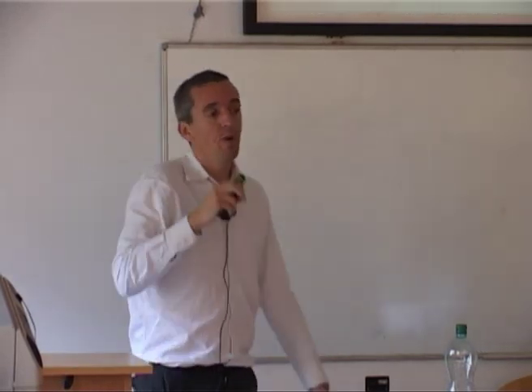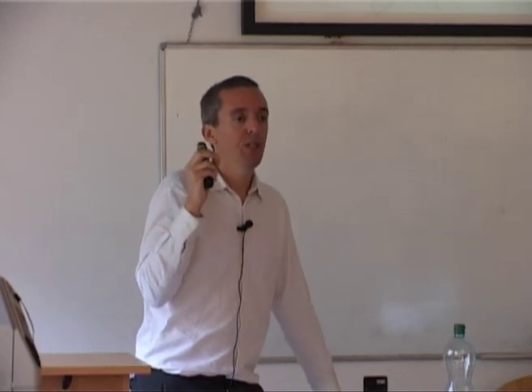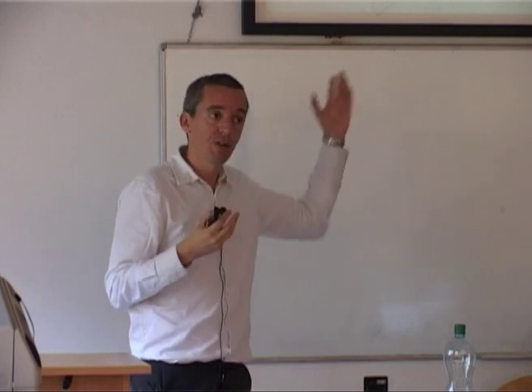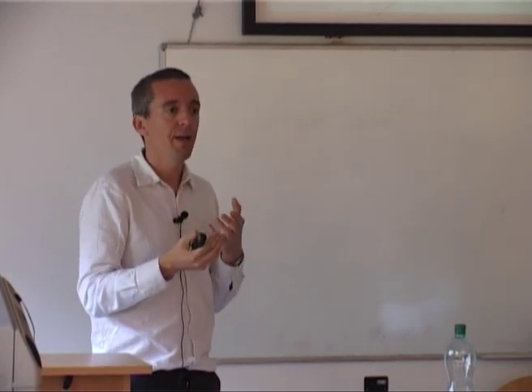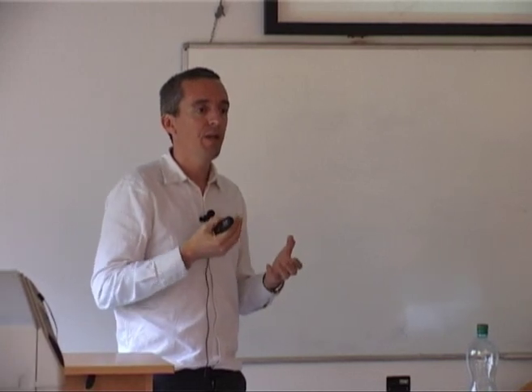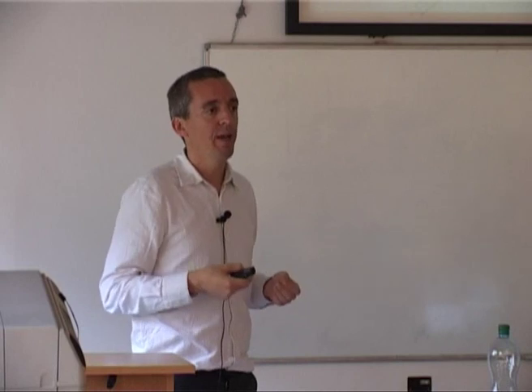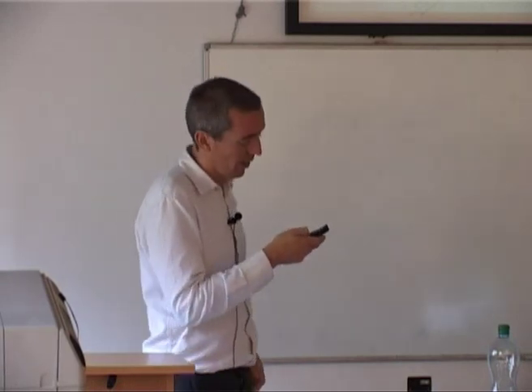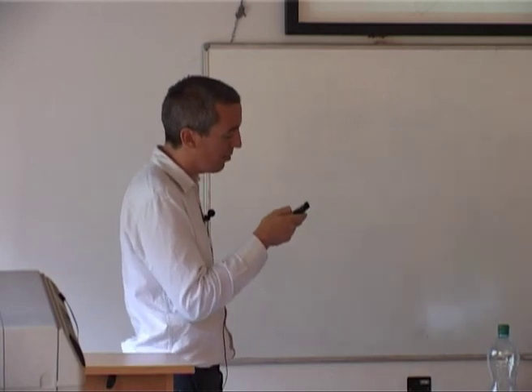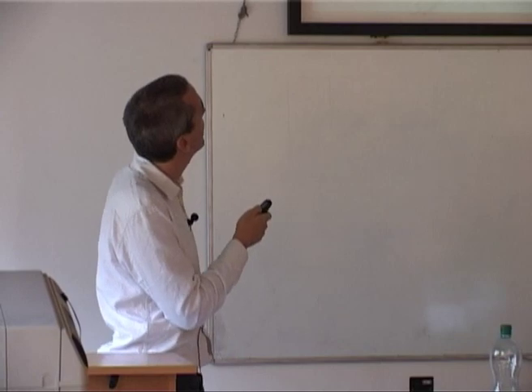I'd like to show you one other illustration. This one will be much shorter, but just to illustrate how we can combine, on a different type of system, transmission electron microscopy with X-ray microscopy to study minerals that are formed by a living organism. This is very new, actually. It's not been published yet. I mean, not even submitted, or maybe today.